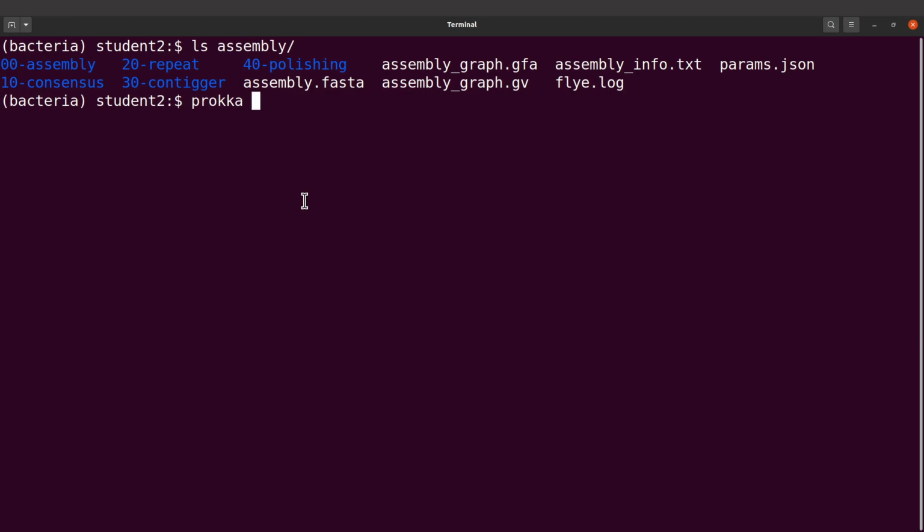All right, so I have typed Prokka, and I'll say dash dash genus, that'll be Staphylococcus, and then species, that'll be Aureus, and then kingdom, that'll be bacteria. And then I'll indicate CPUs. I'll say 4. With the CPUs, you can increase it if you have more capacity.